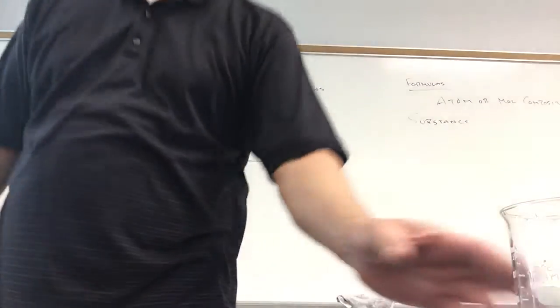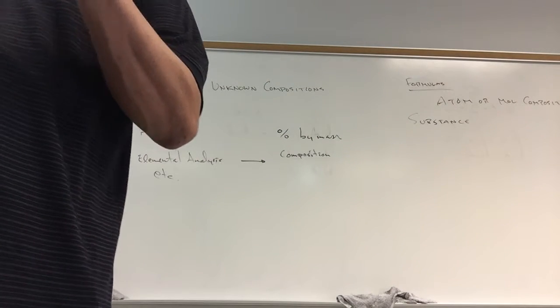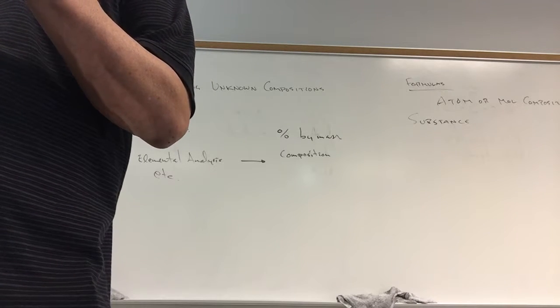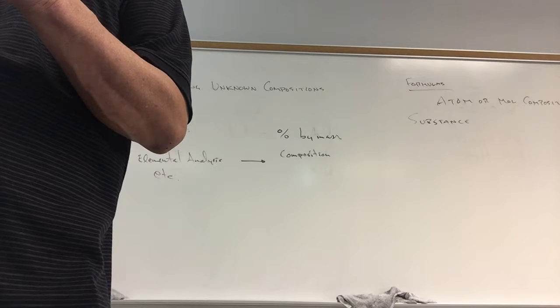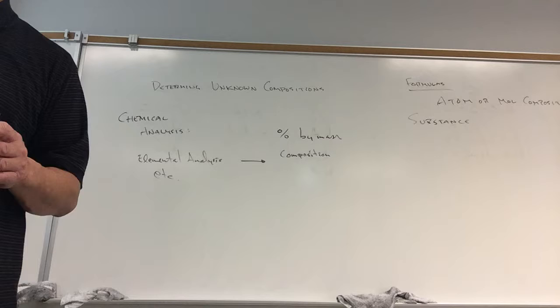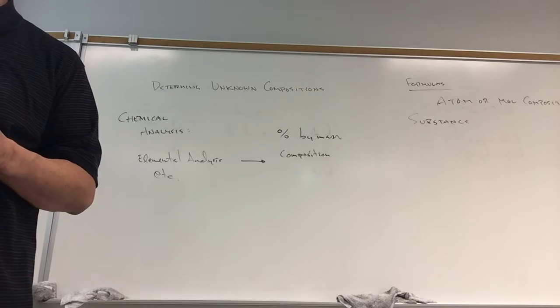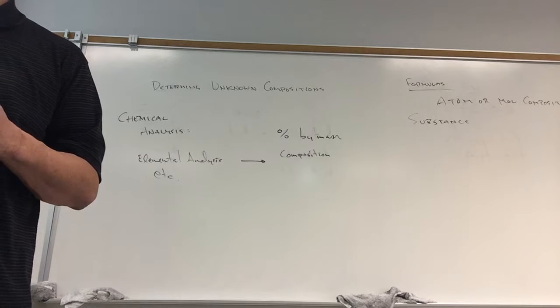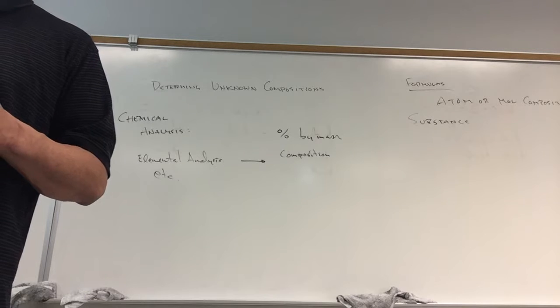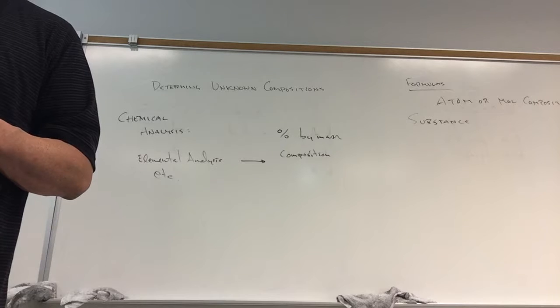Then, it can be costly, so hopefully you have an idea of what elements to expect. So, when I sent out samples, it was about $200, it's probably more now, $200 per element to analyze how much is in there, since we didn't have the equipment ourselves. And there's lots of labs specializing in this. In fact, the samples I sent out to Gardena. There's a lab here in Gardena that does this. And then I just have a checklist, analyze for this element, this element, this element. I don't want to analyze for the whole periodic table. That would be too expensive. But I had an idea what was in there.